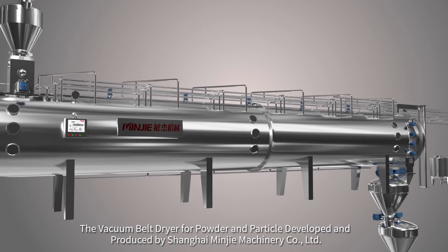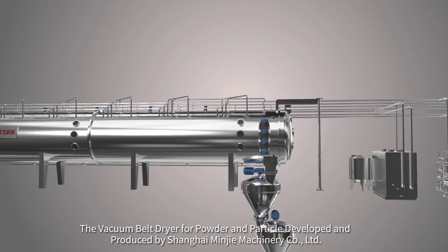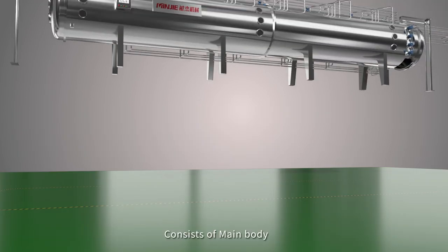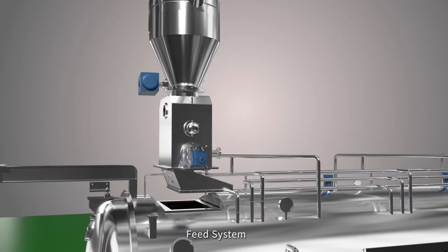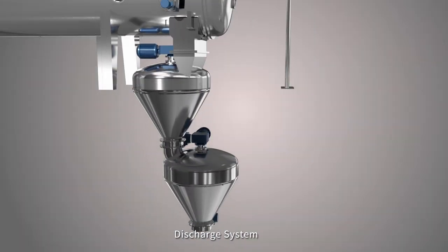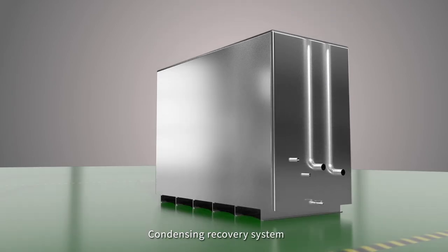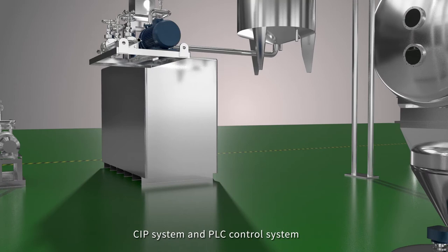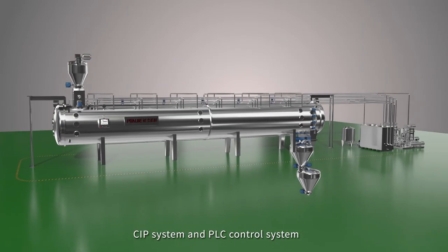The vacuum belt dryer for powder and particle developed and produced by Shanghai Minji Machinery Co., Ltd. consists of main body, feed system, discharge system, condensing recovery system, vacuum system, heating system, CIP system, and PLC control system.